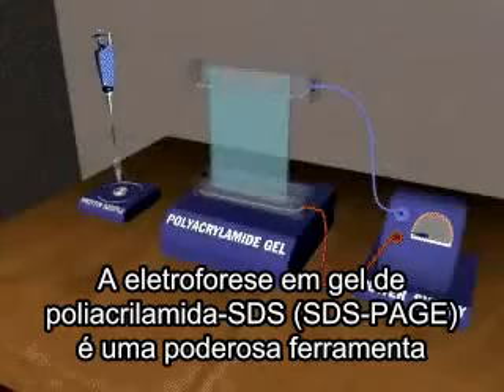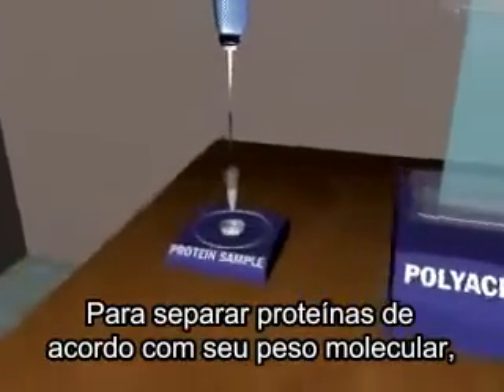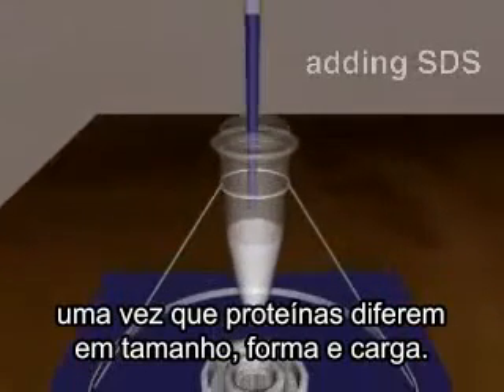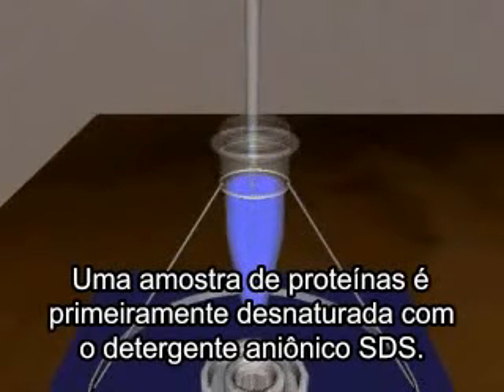SDS polyacrylamide gel electrophoresis is a powerful tool which resolves proteins according to their molecular weights. Because proteins differ in size, shape, and charge, a protein sample is first denatured with the anionic detergent, SDS.